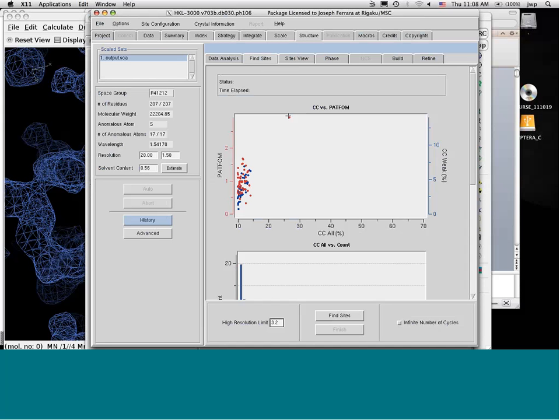So we have another question from Dilip, and he's collected at BM14, maybe that's APS. ESRF maybe, okay. Yeah. A 2.9 angstrom data set. And he tried to solve the structures with AutoSolve, but he's saying he had a problem with data quality. So then he started shooting for redundancy, and he collected 360 frames of peak and remote data. So I think what he's basically asking is, if you have a problem with data quality, will redundancy help you if initial methods fail?